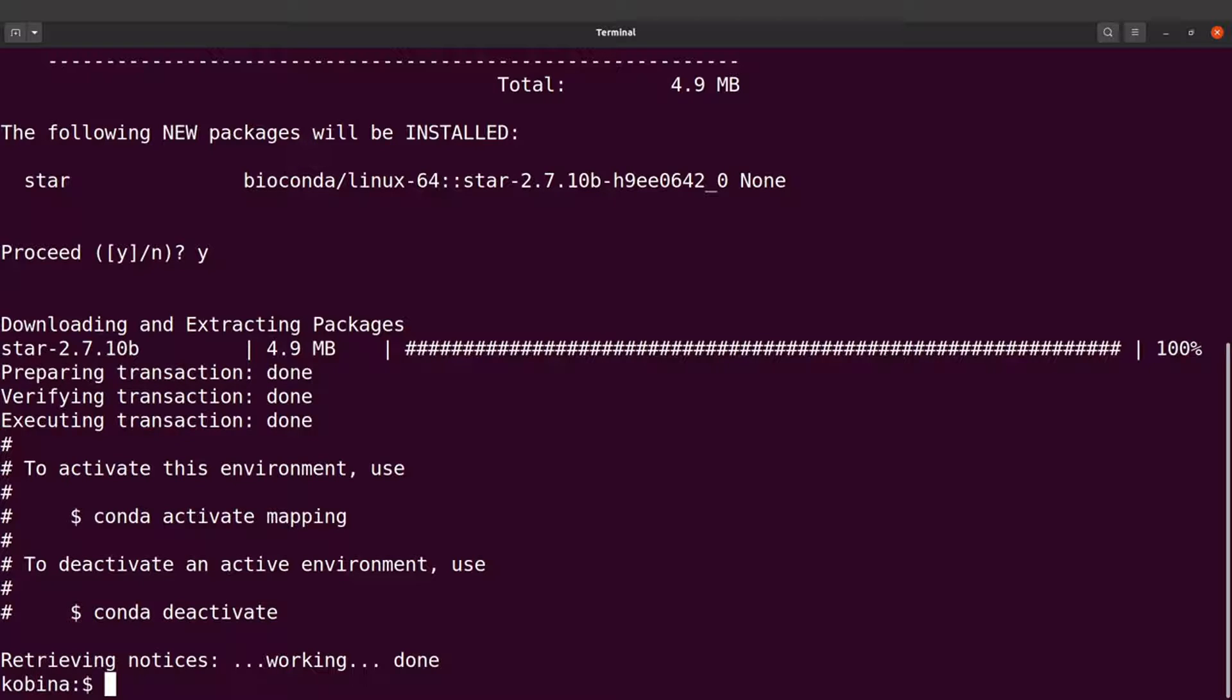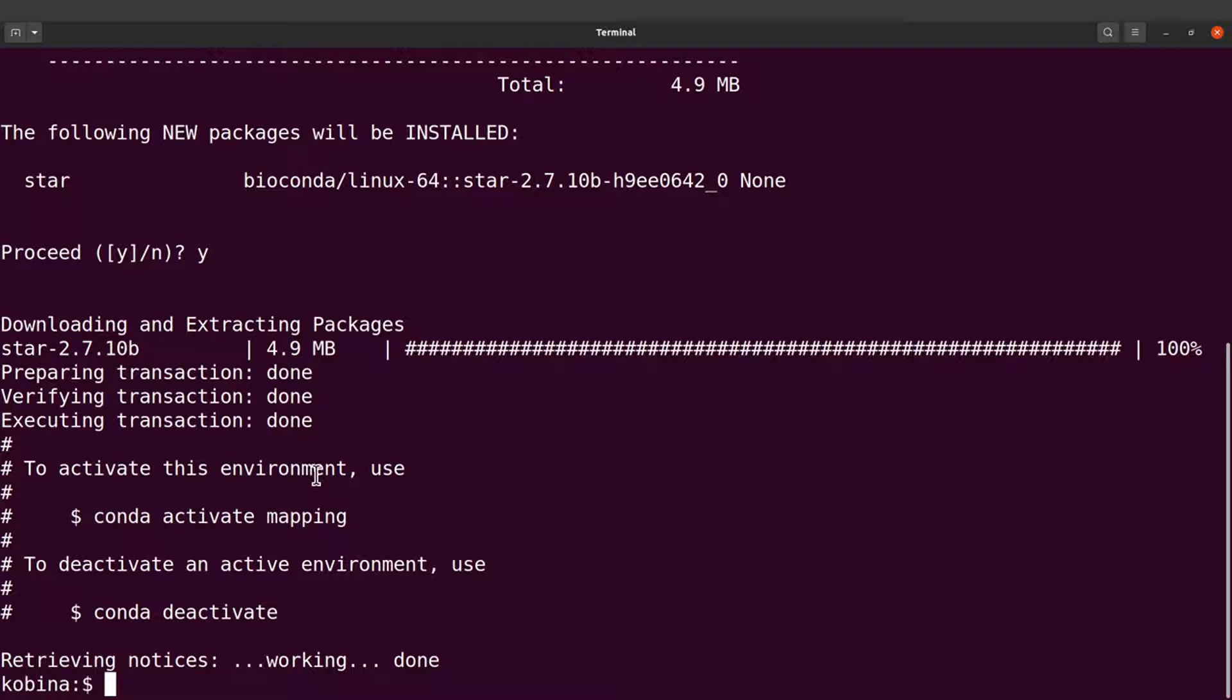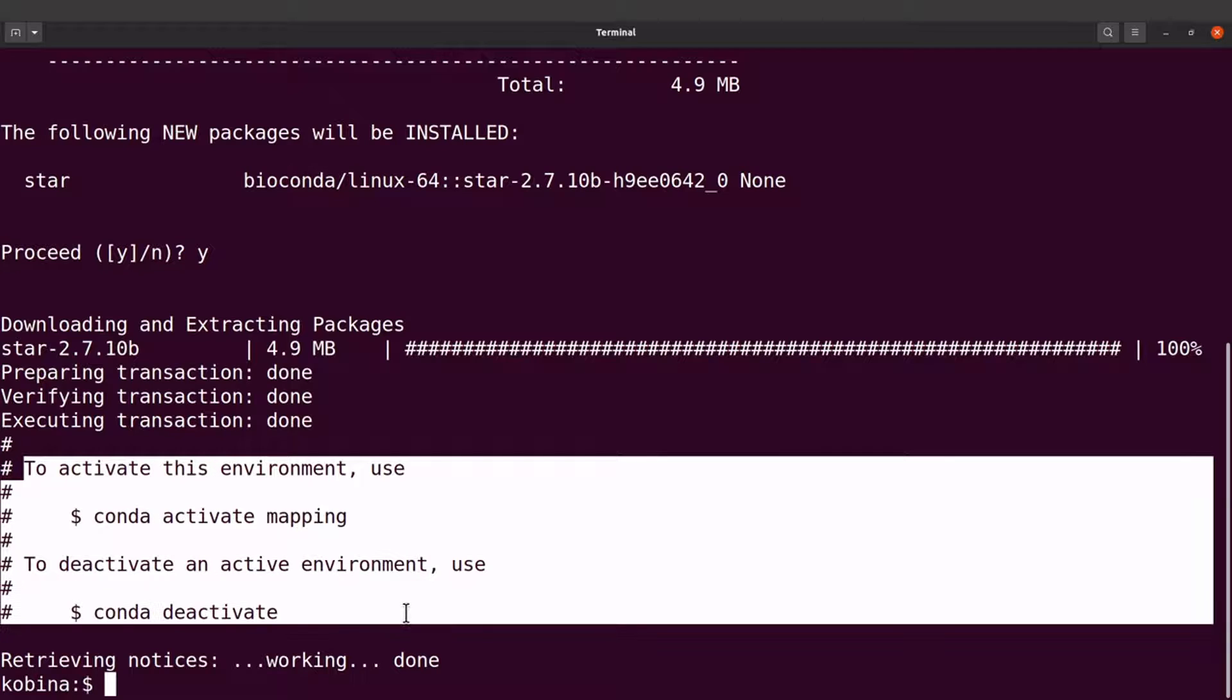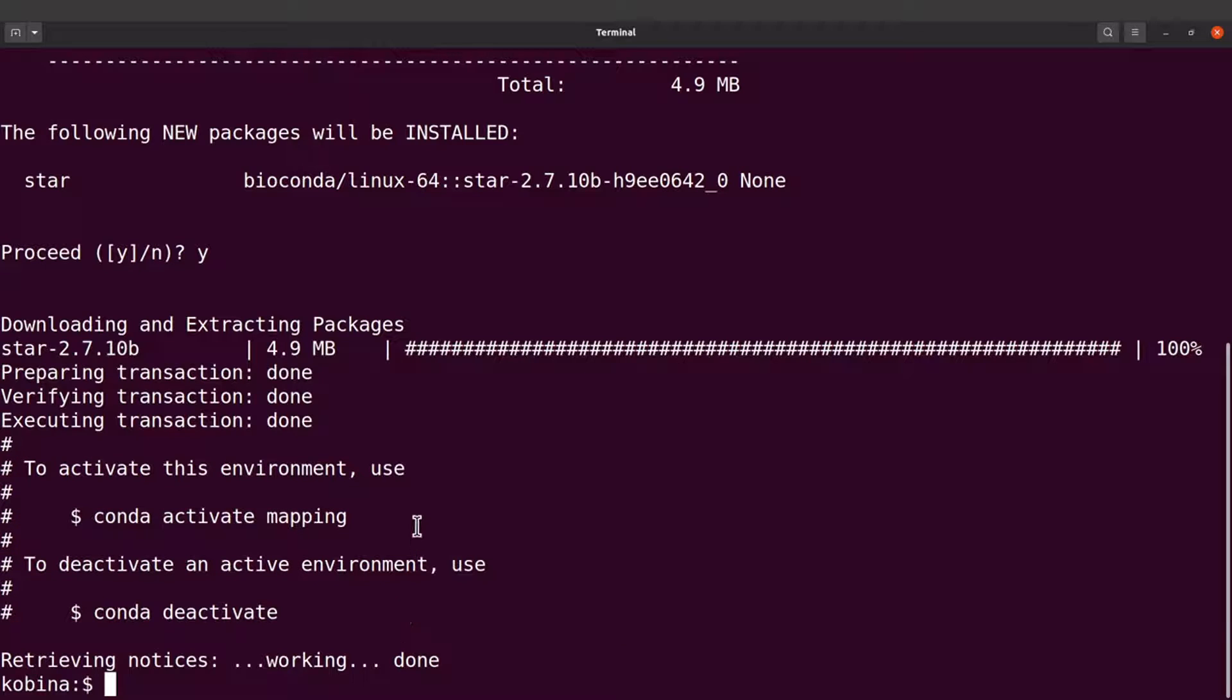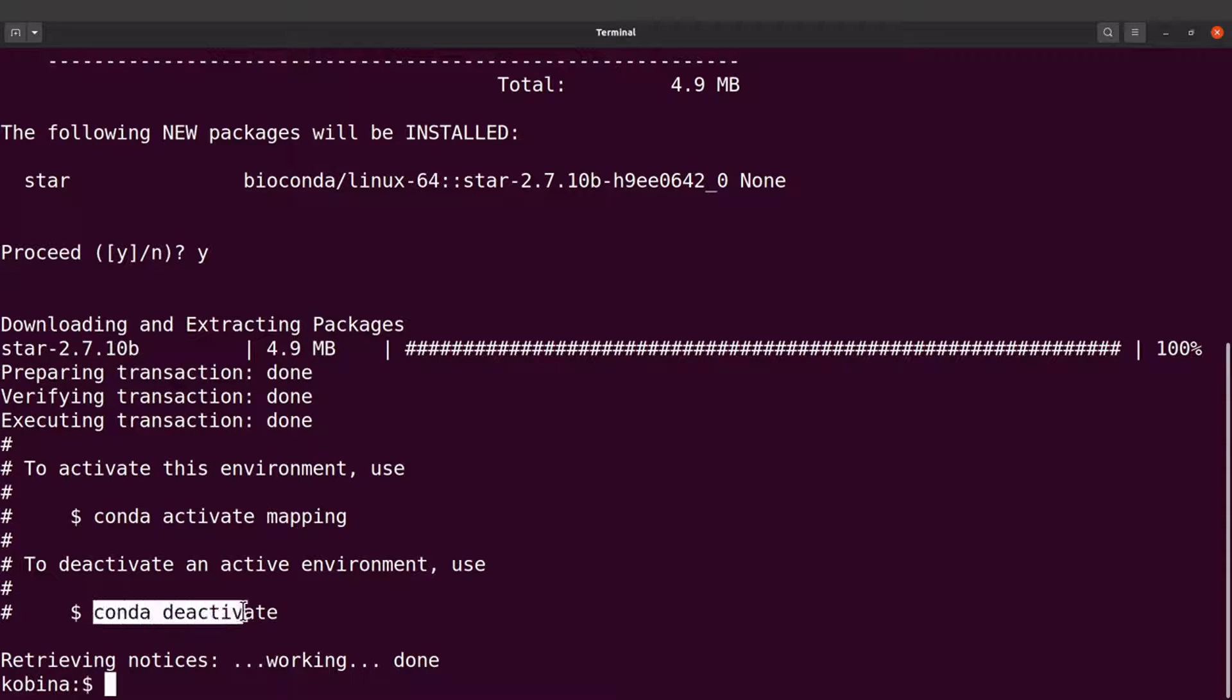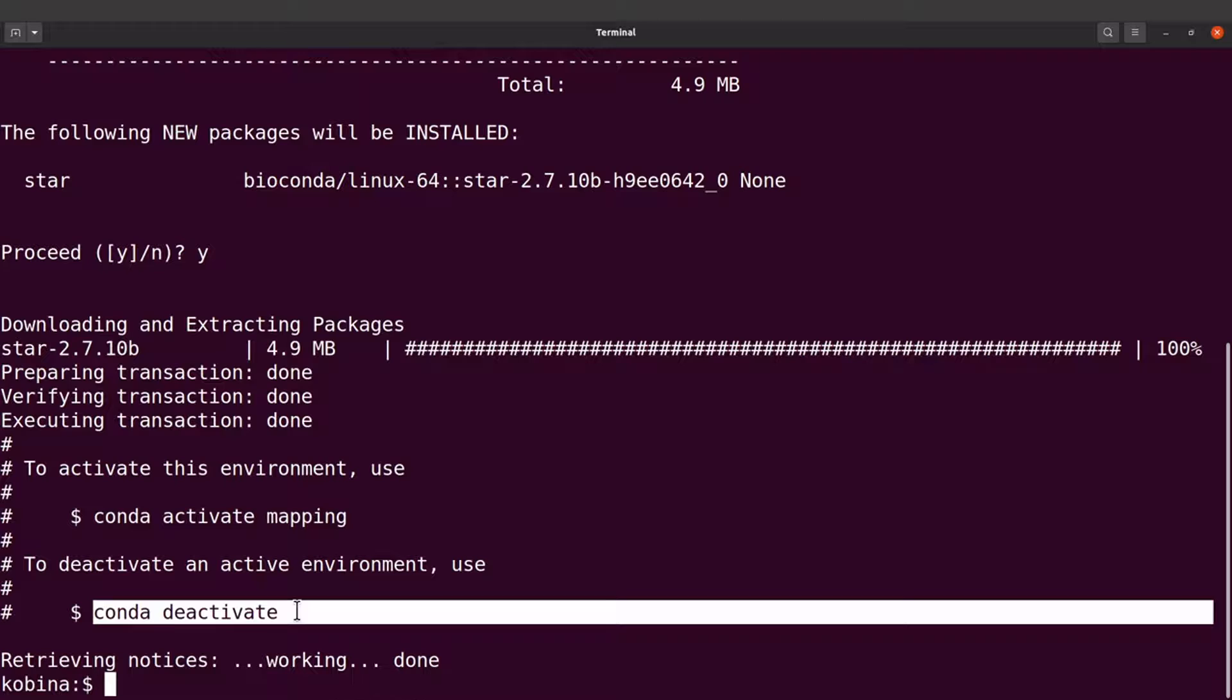So after creating the environment and installing the tool, we will have this statement here telling you how to activate and deactivate the environment. So you activate the environment to have access to the tool. Then you deactivate if you don't want to run the tool again.